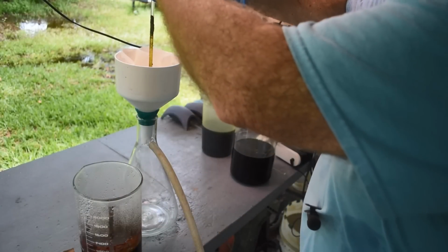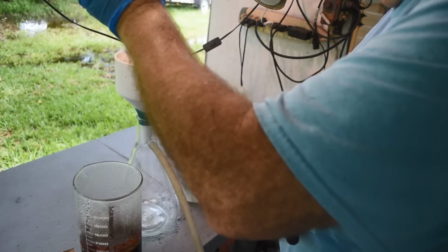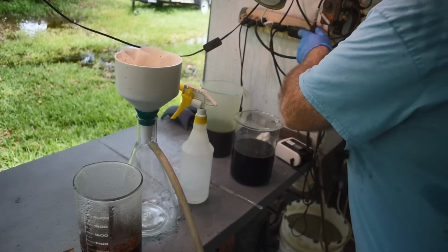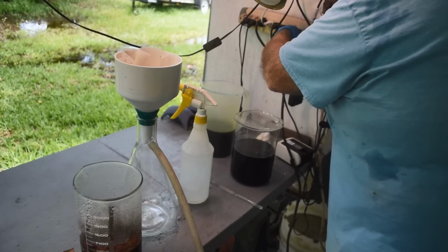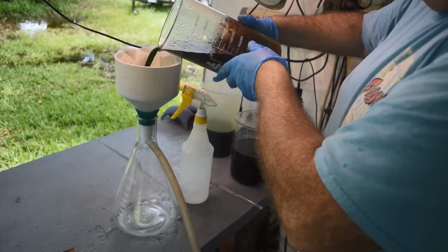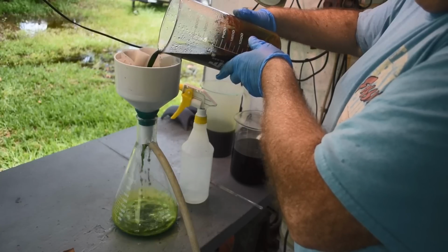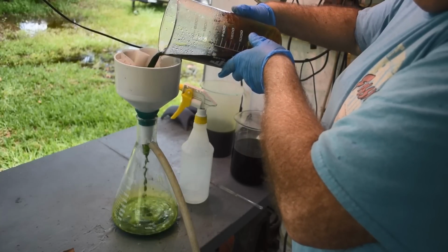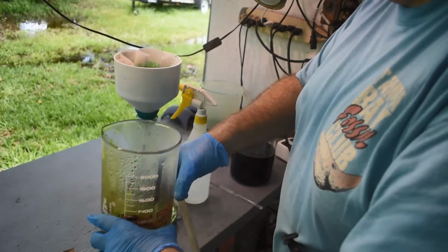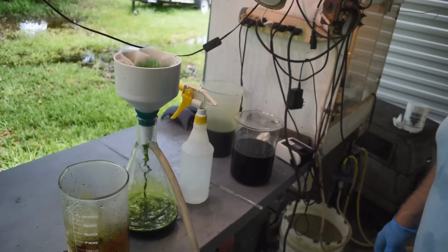And yeah, wow. Let me get this stuff all filtered. Get my stir stick back here. Pump started. Now this liquid is frothy with chlorine gas, so the exhaust of the pump is going to be kind of nasty. And it's probably not good for my pump, but hopefully we can get through all this stuff without locking it up.